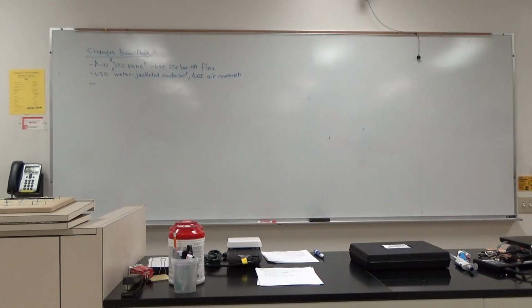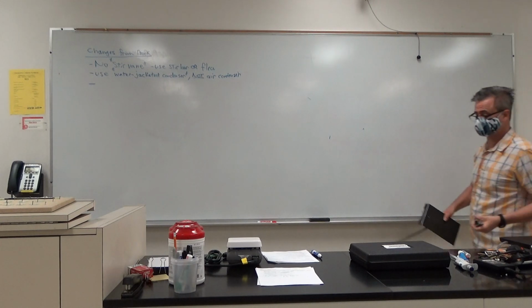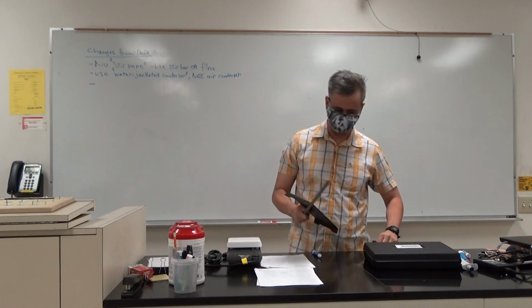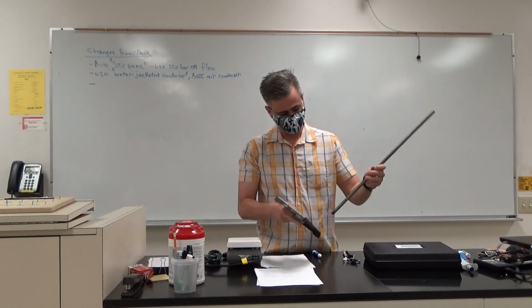Let me show you what the setup is going to look like. One thing I always recommend is that you do what I call a dry setup. Get your glassware set up before you go get any chemical. Sometimes the book doesn't describe it that way. Sometimes it just marches into go get this chemical and stuff like that. Do a dry setup. You don't want to be fumbling with glassware that has chemicals in it. So these guys screw in there like that.